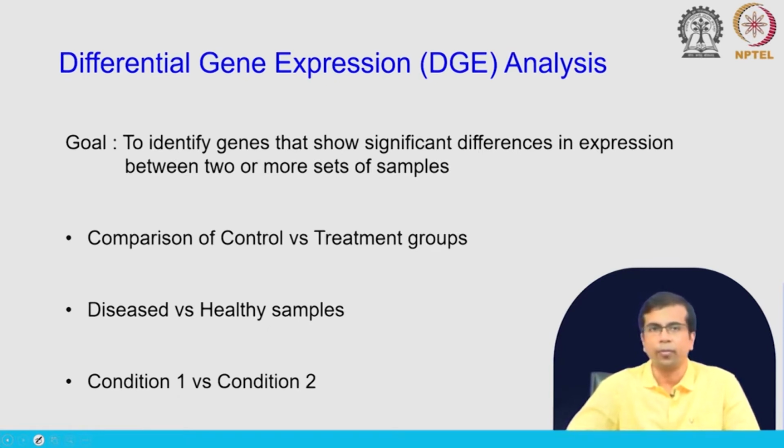So, those kind of analysis can be done. And similarly, for condition analysis, you can have multiple conditions, right. It is not just condition 1 versus condition 2, you can have, let us say, normal condition, then you have, let us say, salt stress, you have oxidative stress, maybe DNA damage, all those conditions, and you can do all these comparisons as well. Okay. All right.